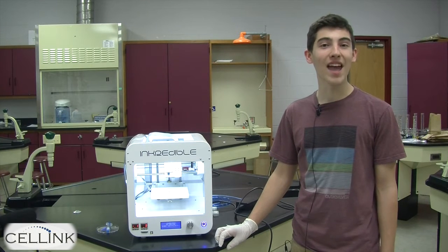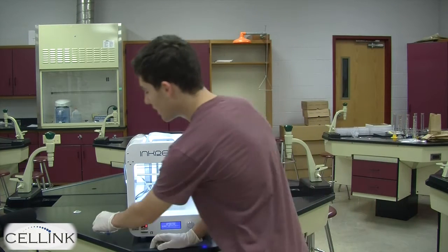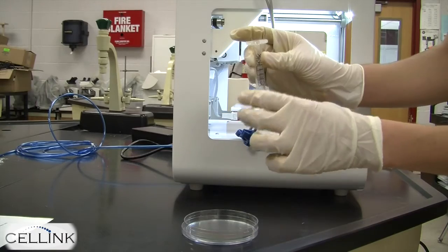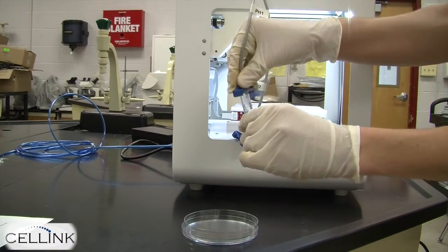Hi everyone. Today we're going to learn how to calibrate the pressure to the bioprinter. First, set up your syringe. Make sure to attach a pipette tip and then place it into the nozzle for print head one on the bioprinter.